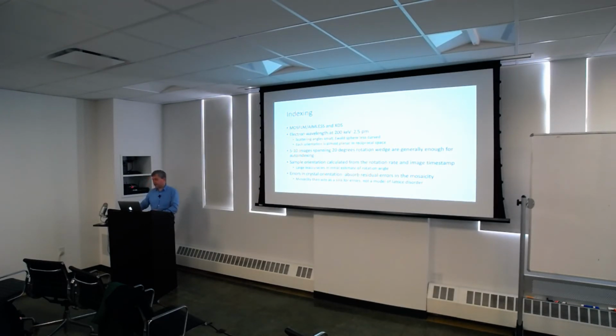And then the other thing is the error in crystal orientation. There's this factor called mosaicity when you process it, which takes into account the imperfections of the crystal or different spacings in the same crystal. The way they run the software, they throw all the errors into the mosaicity. So it's no longer really a measure of mosaicity. It's just more of a sink to throw all of the errors in, and that seemed to work. But then it didn't become a meaningful value.